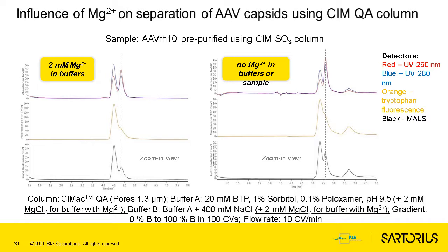So if we are using bivalent cations, empties would usually be stabilized. Urea is also having influence. EDTA, because it is complexing our cations. Keep in mind the citric buffer, which in some cases is used to elute from the affinity column. So citric buffer is making complexes with magnesium or precipitates magnesium or calcium. So all in all, magnesium has quite some influence on the stability of empty capsids.